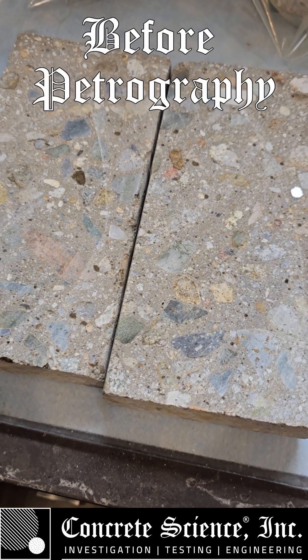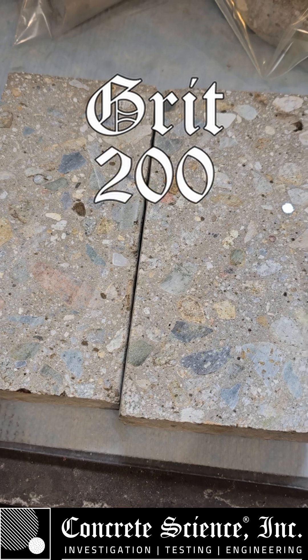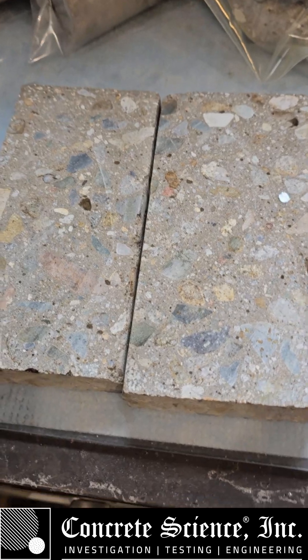Alright, today we're going to turn these two concrete slabs into polished slabs. We're going to take them through grit 200, 400, 600, and 1000. Let's check it out.